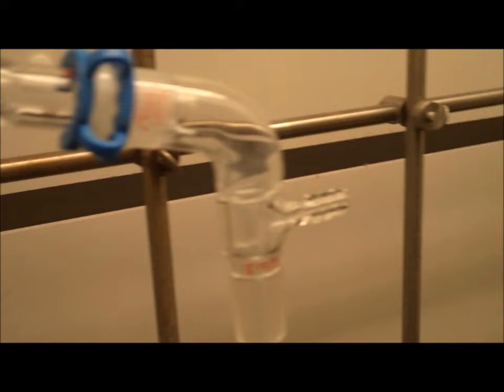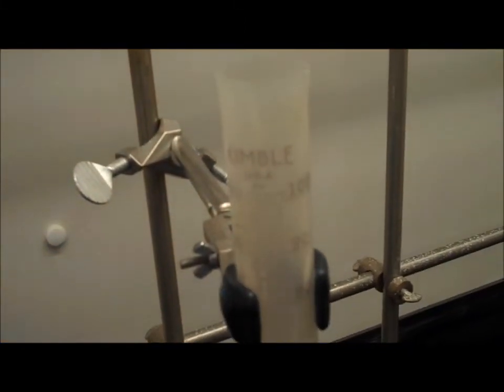Here we have the condenser. Water should be flowing out through this tube and flowing into this tube. Here we have the spout, which will pour your distillate into your graduated cylinder.